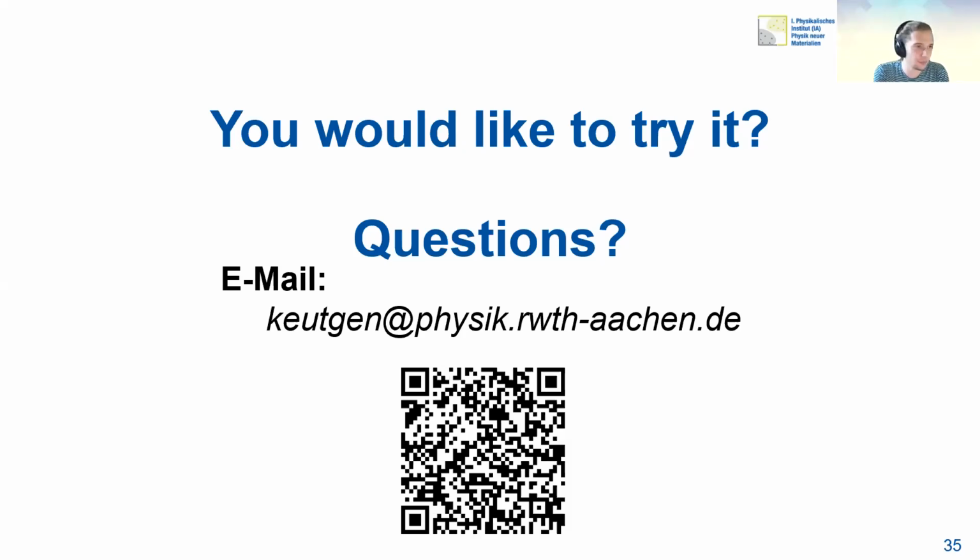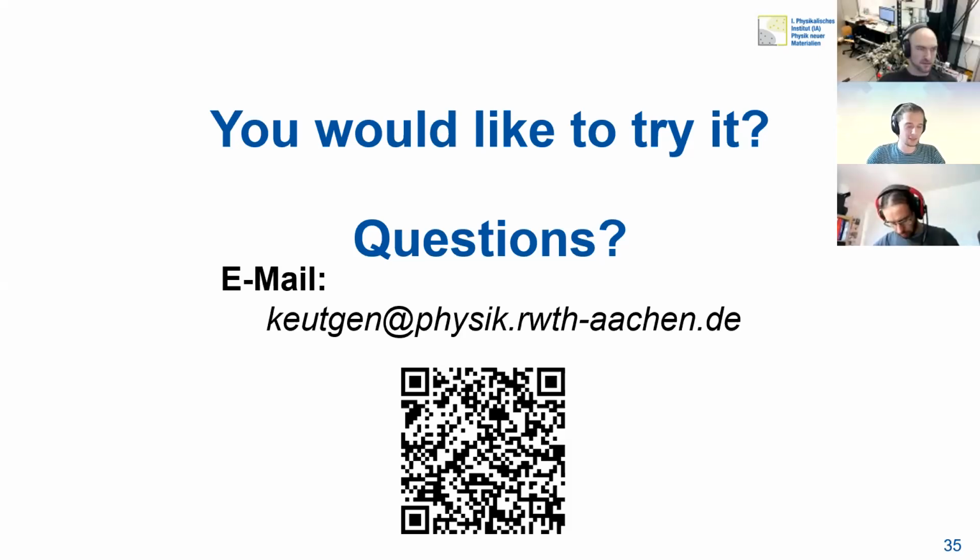In the future, maybe I'll provide a link, but especially as MATLAB versions change for everyone who's using this, I like to stay in touch with everyone who's working with it. Just write me an email and I will provide you the software itself. You can just install it in MATLAB, and inside the software is something I included that, when it starts, checks for a new version and automatically updates it. So even if we don't stay in touch, you'll always get the newest version. Besides this, I just like to know who's using it for the moment, and maybe I'll publish it, but I'm not sure yet.